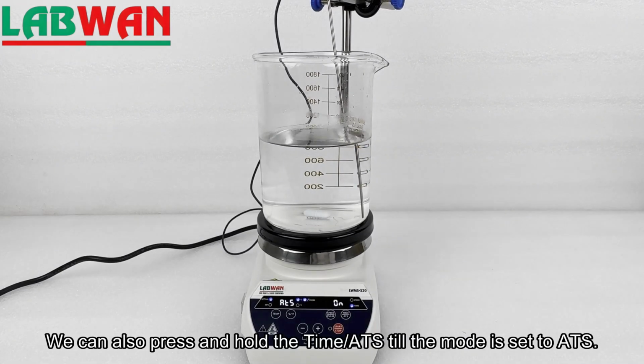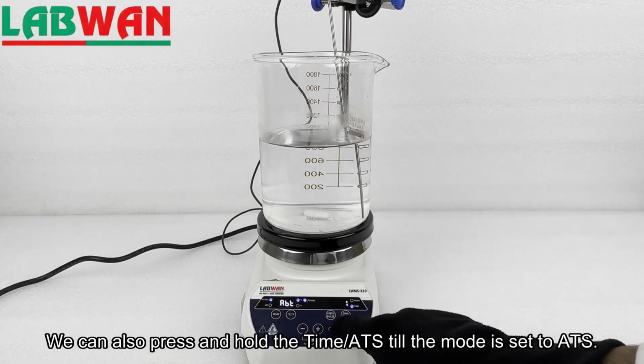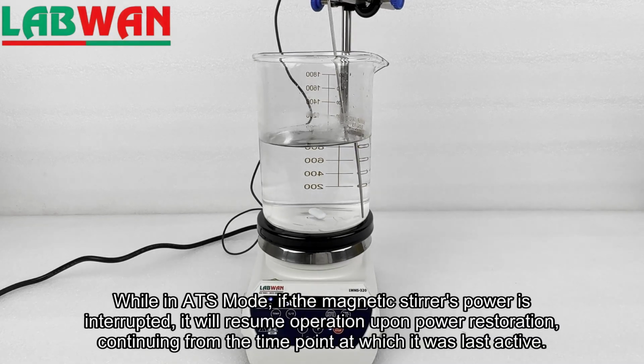We can also press and hold the time, ATS till the mode is set to ATS. While in ATS mode, if the magnetic stirrer's power is interrupted, it will resume operation upon power restoration, continuing from the time point at which it was last active.